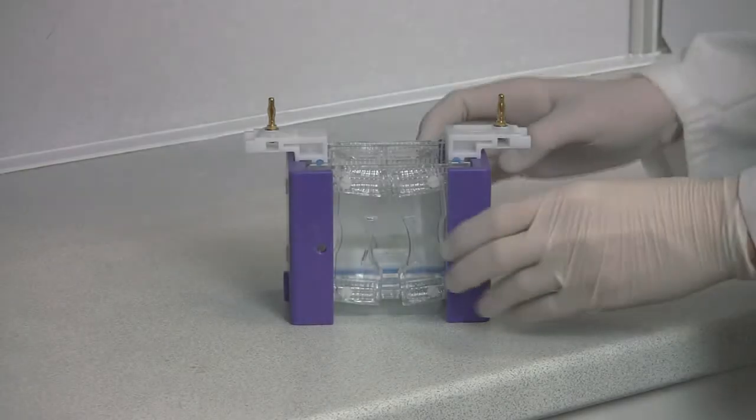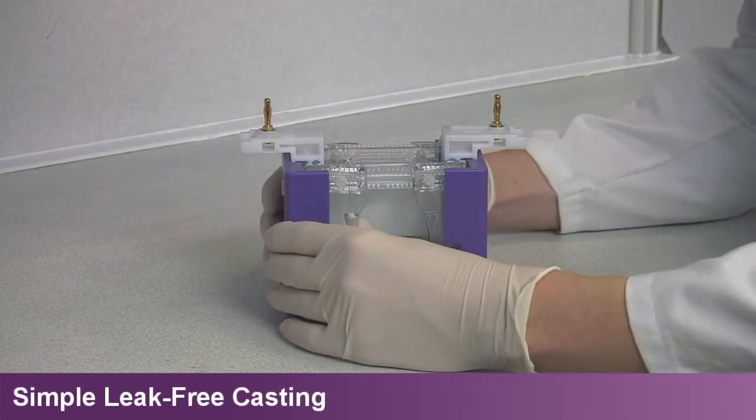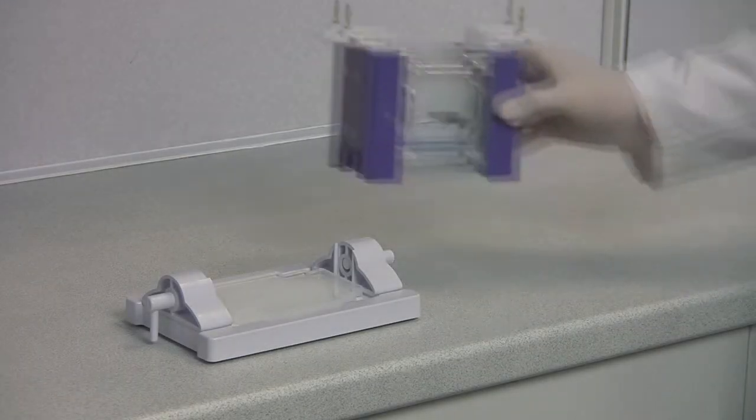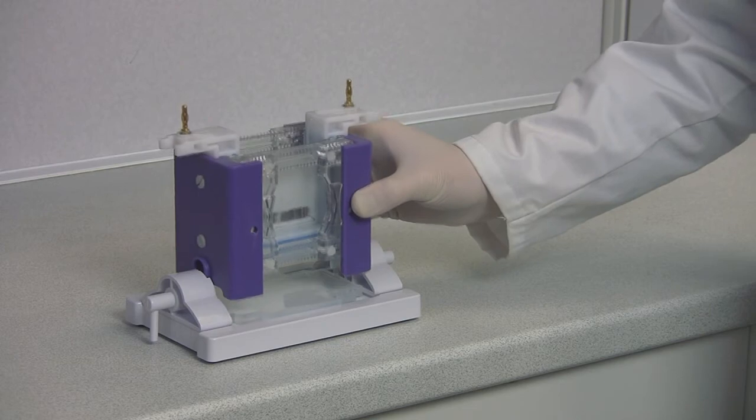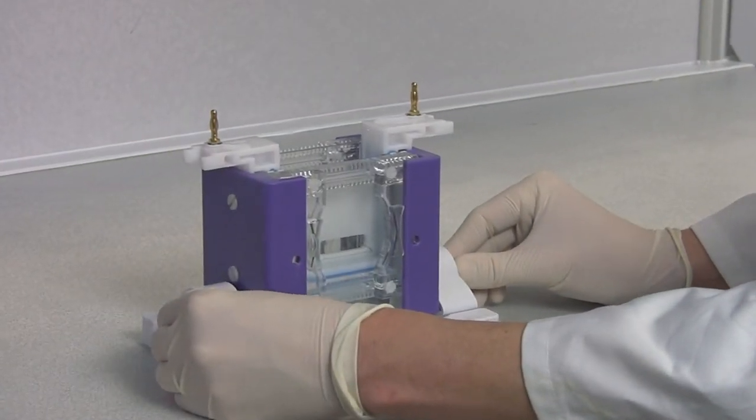The unique sliding clamp technology of the Page Insert ensures simple, rapid, leak-free gel casting. The ultra-soft moulded silicon mat acts in tandem with glass plates and bonded spacers to provide a leak-free seal.